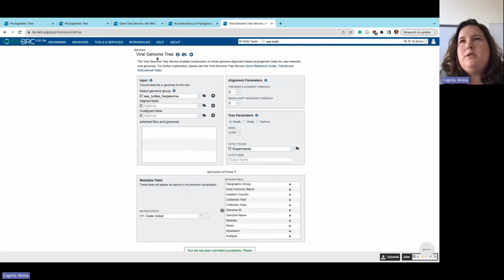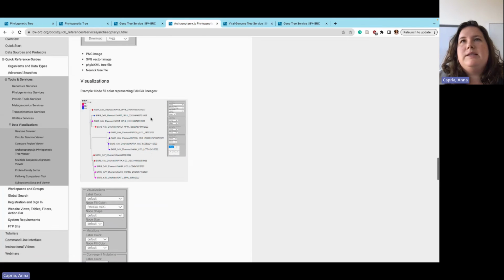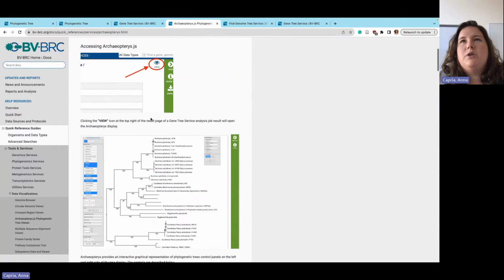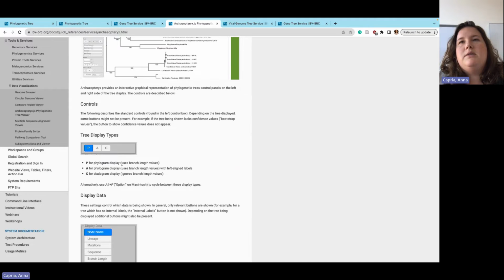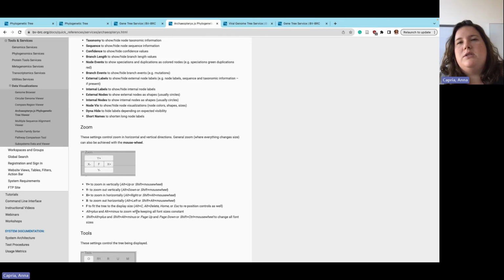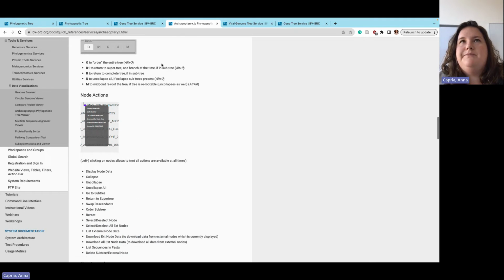All of the BV-BRC services have reference guides, tutorials, and most have videos. So if you wanted to go back to how to run the viral genome tree job after this, the tutorial is a great place to start. And I want to point out the Archaeopteryx reference guide. This has a lot of good information about all the different ways that you can work with the Archaeopteryx viewer, which I'll quickly go through. But if you were wondering, what is the P meaning, or what do the different zoom settings mean, this is a great place to become more comfortable with Archaeopteryx.